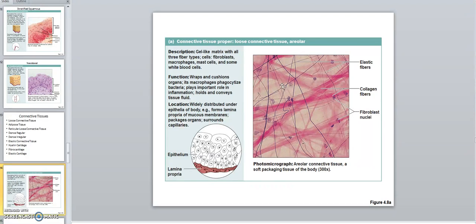Go back to the histology PowerPoint and look at that. So tie this in. Lab is an additional thing to the didactic portion of this course. So don't just do this and not go back and study, but connective tissue has cells, fibers, and AGS, amorphous ground substance. See, loose means it's not that many fibers.